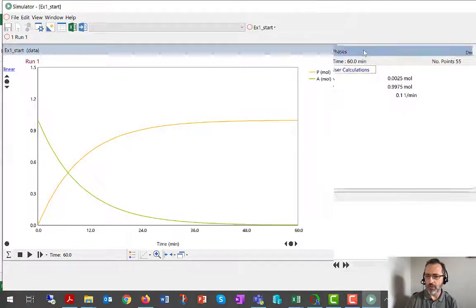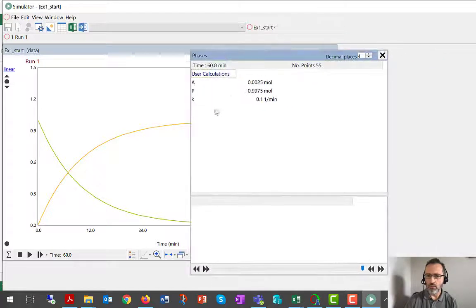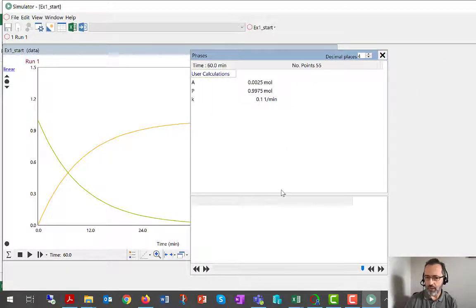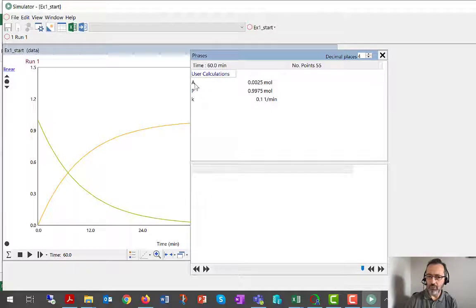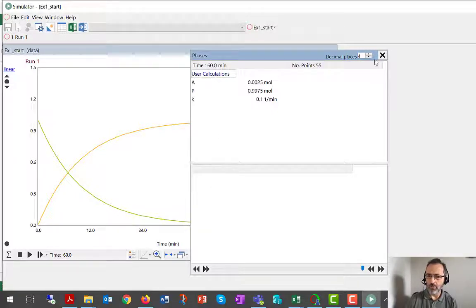Similarly, if we look in list phases, there won't be any phase or race sections in here. There will just be a plain list of all of the user-defined variables.